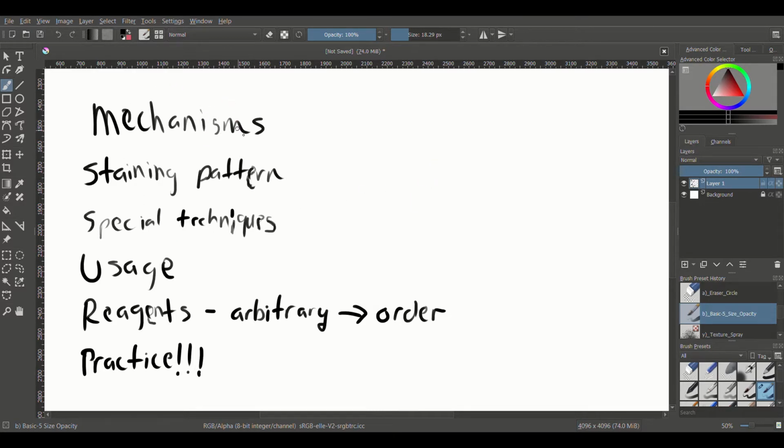When you're looking at a special stain, you'll notice that thus far, there are a lot of mechanisms, and a lot of those mechanisms are common between different stains. So a mechanism might be using a metal mordant to adhere a dye to something, and then using excess mordant to differentiate that, like in our elastic stain.